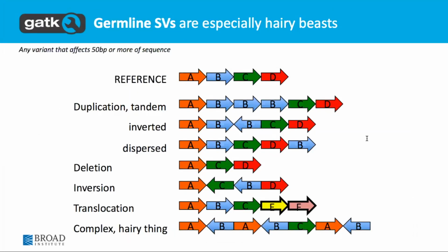Right now there's a big pipeline for doing SV calling that came from a collaboration between the Talkowski lab at MGH and also our SV group from the GATK development team. There recently came out a paper on this structural variant calling on gnomAD, which I recommend you check out. It's state-of-the-art structural variant calling right now at the moment.